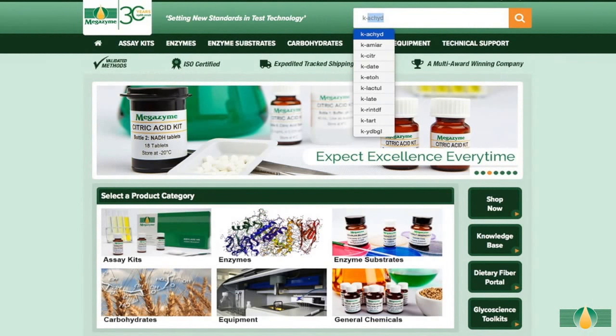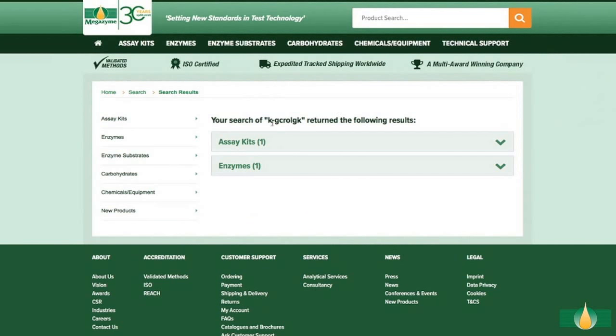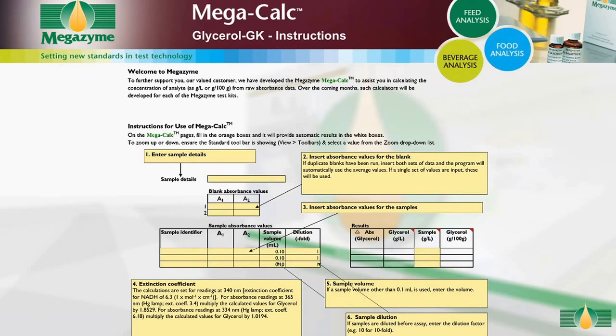Megazyme has also developed specific Excel-based MegaCalc applications for each Megazyme kit to allow quick and easy results analysis. Results can be analysed using the MegaCalc application specific to this glycerol kit, which is available to download free of charge from the Megazyme website. The MegaCalc spreadsheet provides full instructions for use.